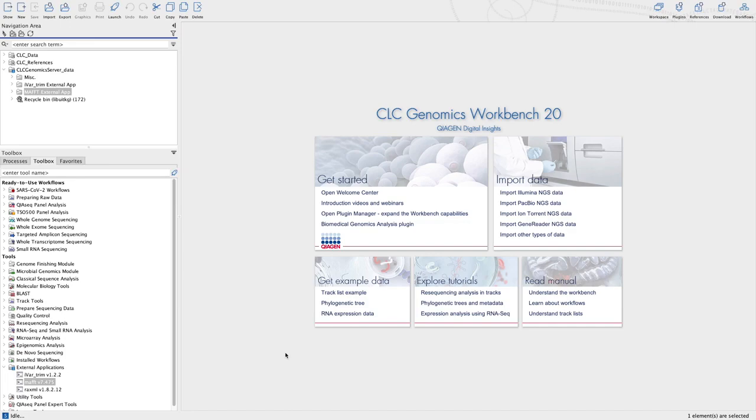My name is Kevin Libwit and this is the second video of a three-part tutorial series on external applications for the CLC Genomics server platform. In the first video of this series, I introduced my three-step approach for writing external applications, and we walked through each step in detail to create an external app for the ivar trim command. In this video, we're going to walk through those same steps to write another external application, this time for MAFFT, a very popular multiple sequence alignment program written by Kazutaka Katoh at Osaka University in Japan.